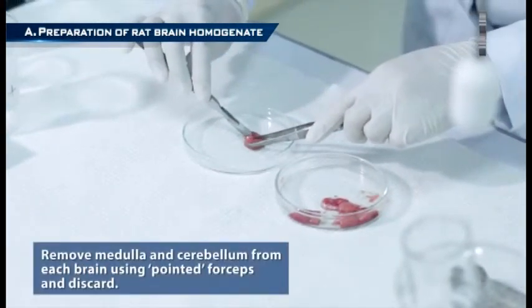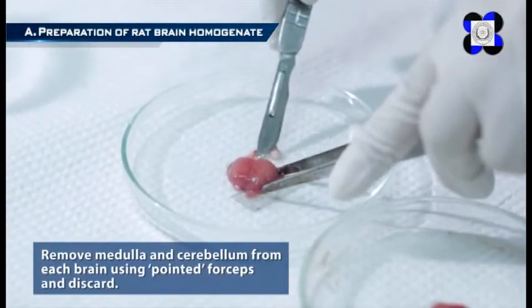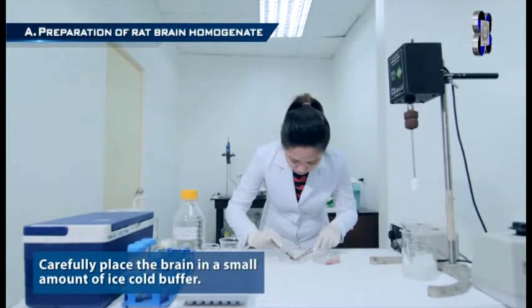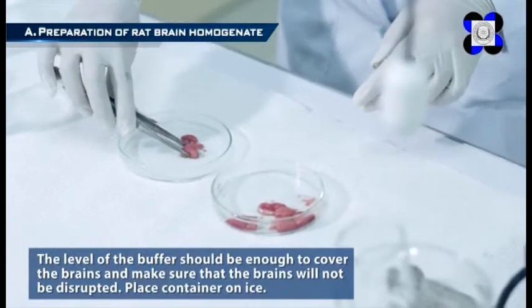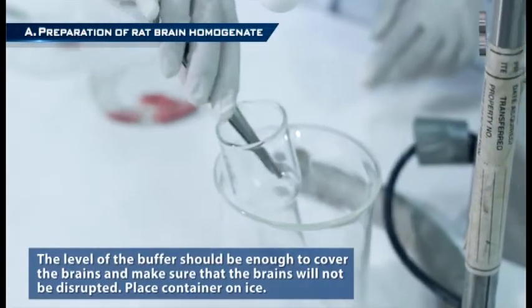Step 1: Remove the medulla and cerebellum from each brain using pointed forceps and discard. Carefully place the brain in a small amount of ice-cold buffer. The level of the buffer should be enough to cover the brains and make sure that the brains will not be disrupted.